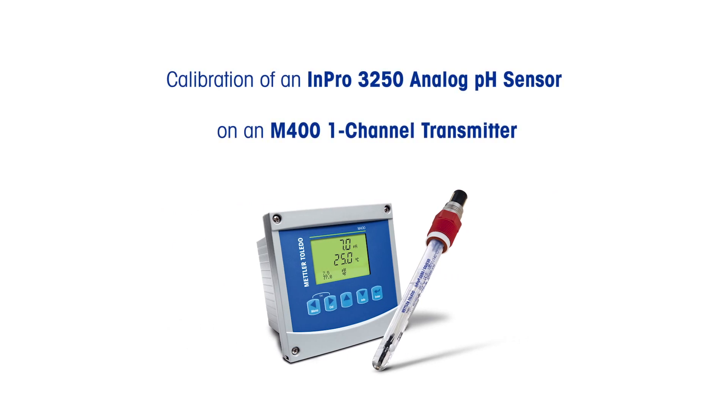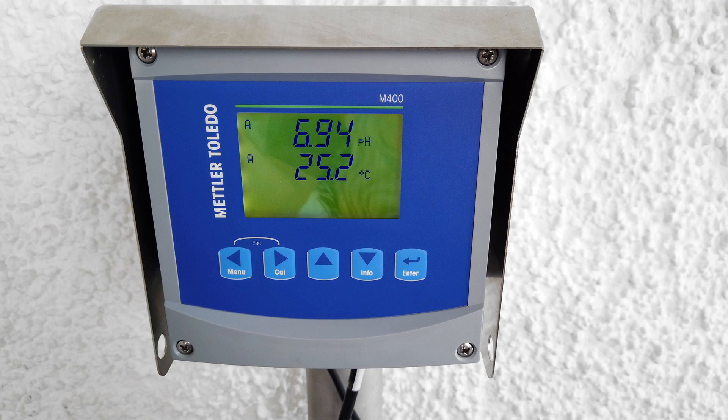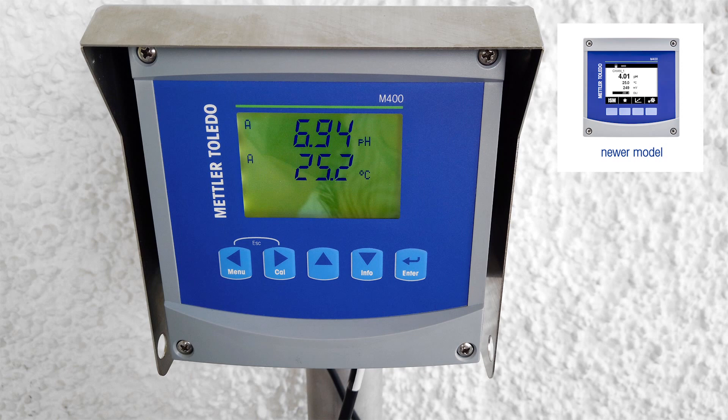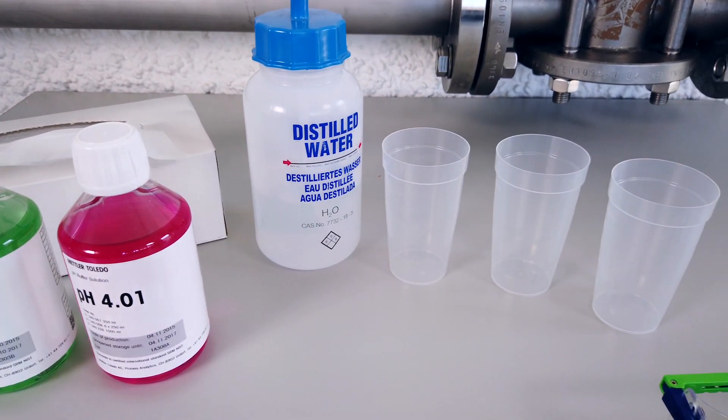Here's how to do a two-point calibration on a Mettler Toledo InPro 3250 analog pH sensor using an M400 one-channel transmitter. This M400 model was produced from 2008 to 2018 — if yours looks different, please find our calibration video on the next generation of M400. For a two-point calibration, use pH 4 and pH 7 buffers.